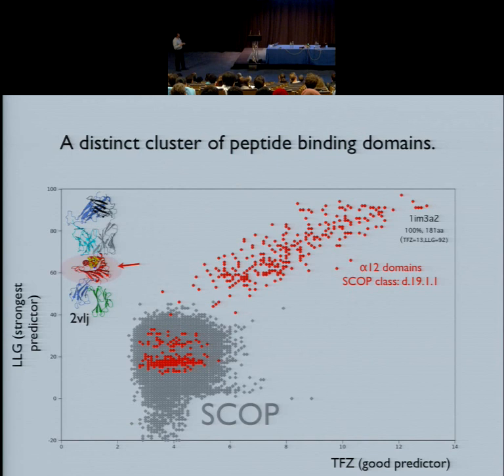When we analyze this top subset, it happens that all of those domains marked in red correspond to the peptide binding domain. So this is a really nice validation that in the case when you have 22% of the structure, you can effectively get many, many solutions. And can it go even lower? When you look at some of those gray peaks here, those actually start to correspond to the individual Ig domains. So you can even go as low as potentially 12% in this case, if you select the right domain, to get a significant solution which can be identified.